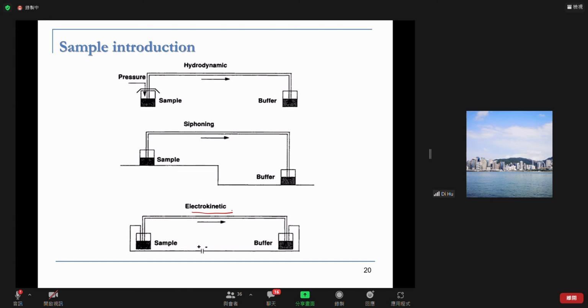If we want to do that, we just put one side of the capillary tube into the sample solution, and then apply high voltage over this capillary tube for a certain time. This sounds the same as what we do in analysis, right? So how does the sample get introduced then? You apply voltage. So they are introduced by their apparent mobility, right?